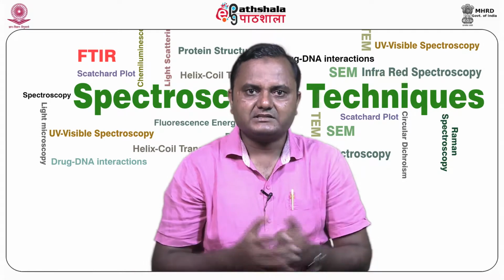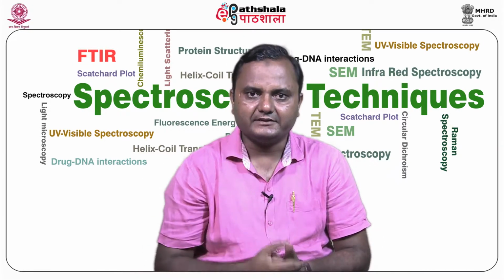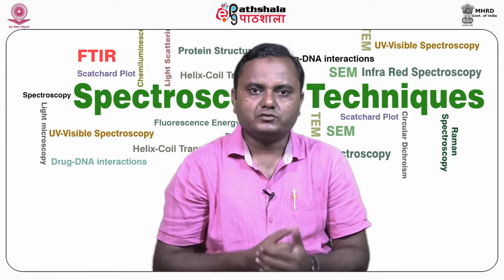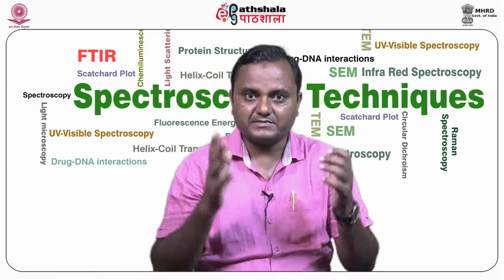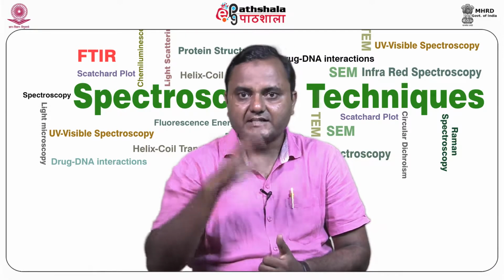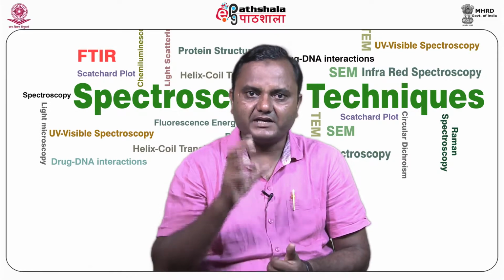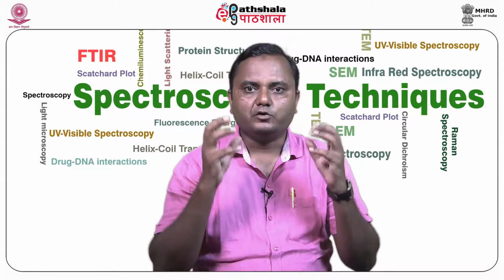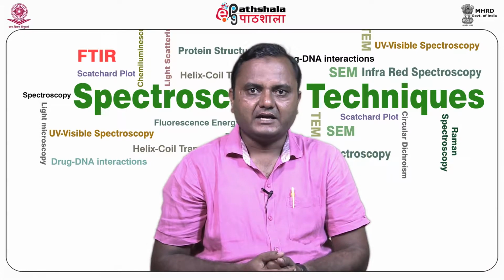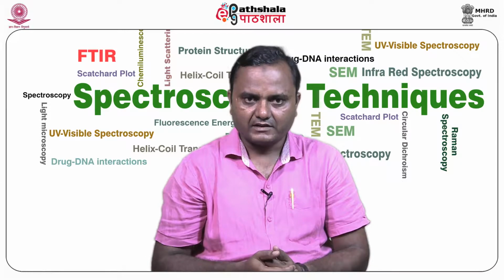Since the light is passing through a small window at 90 degrees, flare and noise created by the change in the refractive index can be minimized. As a consequence, a right angle light scattering detector is the simplest form of SLS detector, having low noise, the best signal to noise ratio, and the best sensitivity.